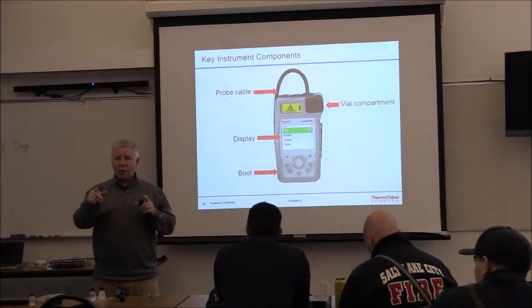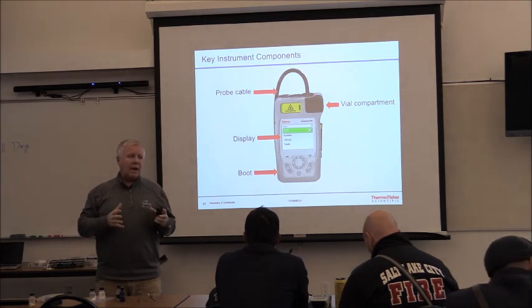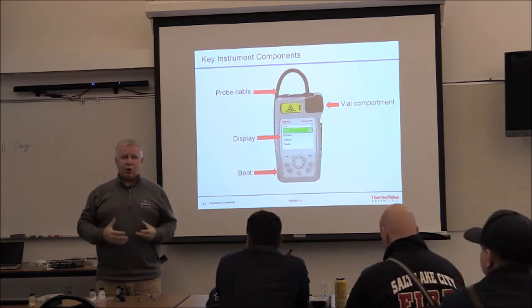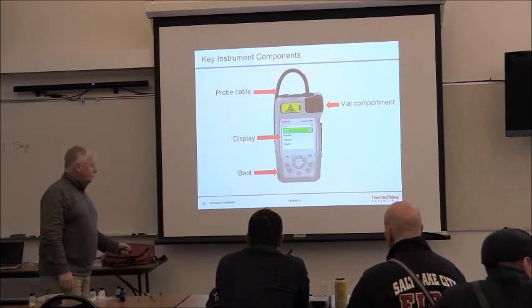You can charge the batteries in the device though. You can do it that way. The only thing the device doesn't do if you charge the battery that way is try to discharge and condition it. But you can plug it in right at the bottom and so forth.